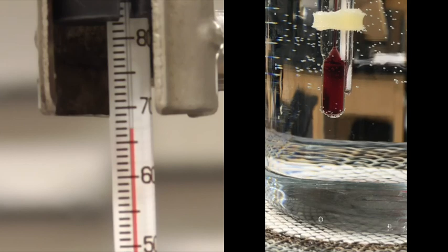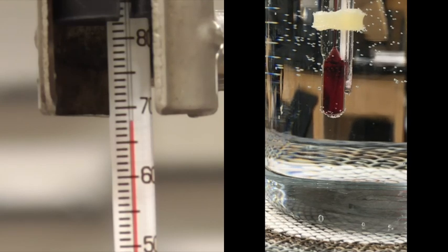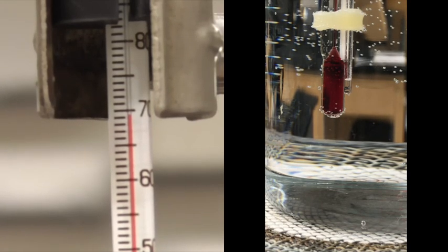Take it out again. Looks like it did it pretty well. Alright, there we go. Give us a couple ranges. Hopefully that second one was better than the first.